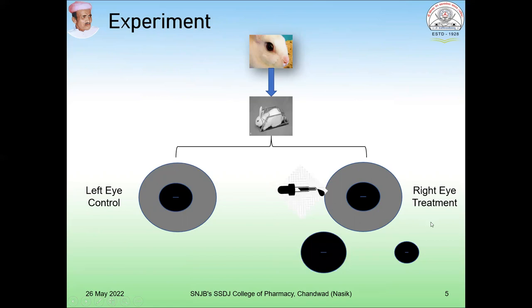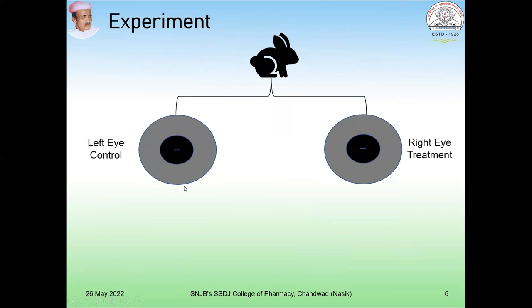Apart from the drug effect, you can also check reflexes — light reflex and touch reflex. For the light reflex, you use a torch to put light on the eye; the eye should show blinking. Either there is blinking or there is no blinking, and accordingly you record the response. For the touch reflex, you take a cotton bud and keep it near the eye of the rabbit — it will show blinking. Record whether responses are present or absent.